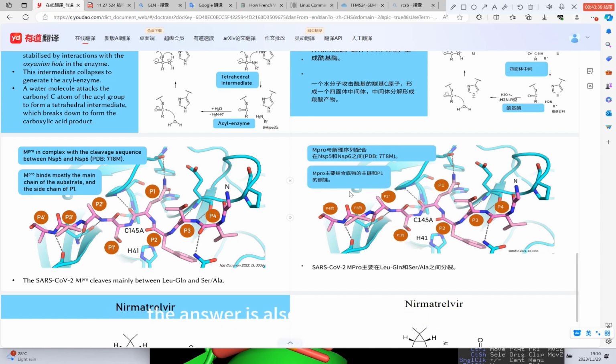The enzyme is also specific in the sense it must recognize a glutamine here. And then here must be something smaller, cannot be big. If it's big, it cannot go inside. But the rest, for example P2 dash, P3 dash, P4 dash, basically can be any sequence because you can see the side chain is here, is exposed, a bit of space here, a bit of space here. Okay.